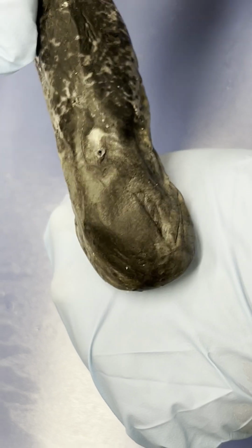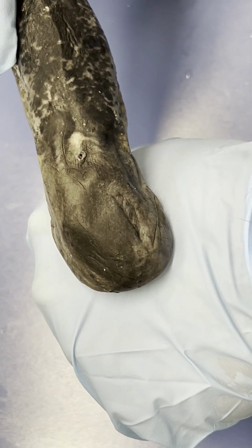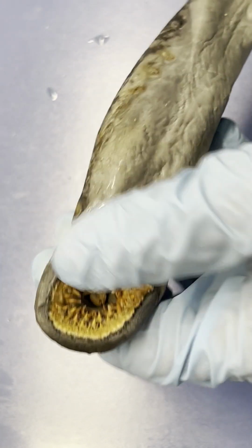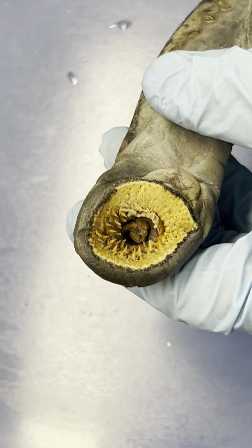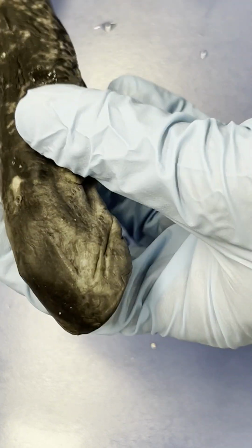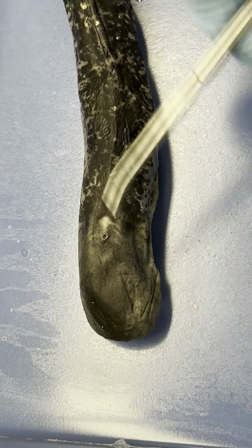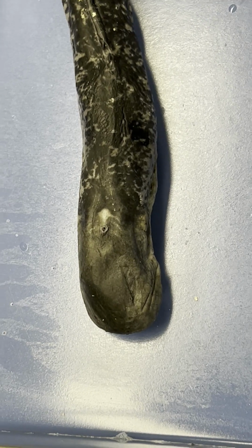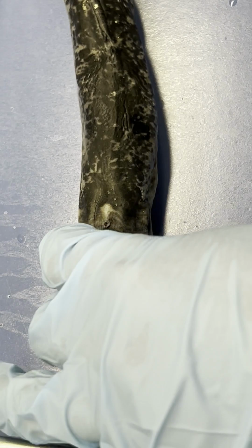So it's more or less the same thing. The lamprey is going to latch onto a fish, usually the belly of the fish in this case, and then use that tongue again to start protruding out and feeding on blood. So a little bit about lampreys. Very amazing animal just because of how old their lineage is. So let's go over some external structures, and then we'll eventually go over some internal structures. But external structures, the easy parts.